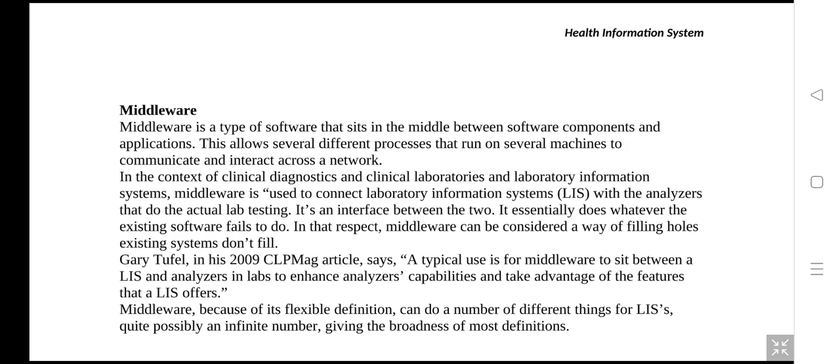Now, we're talking about these protocols, which have been introduced between the instrument and the LIS. These instruments are also equipped with a software called middleware.